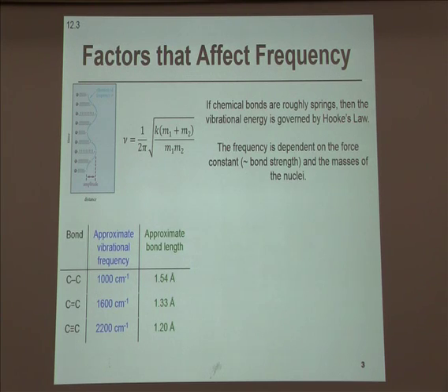And in general, in IR spectra, we see triply bonded stretches further to higher frequency than we see those of singly bonded species, as long as we're talking about the same two atoms on each end of that bond.